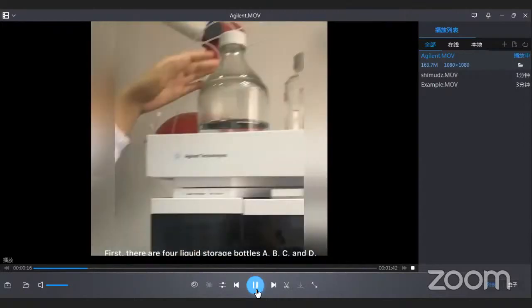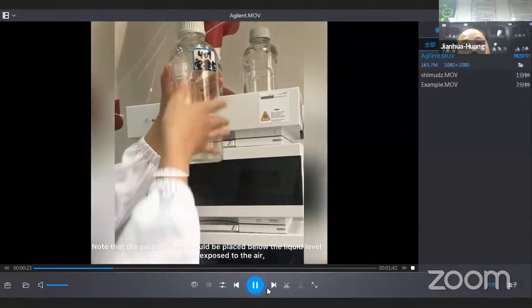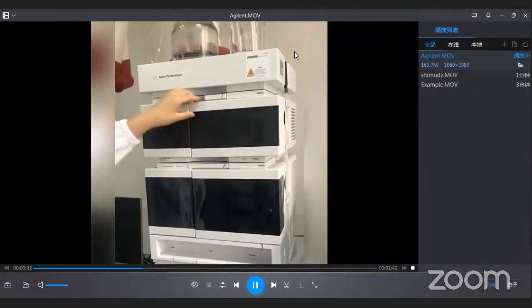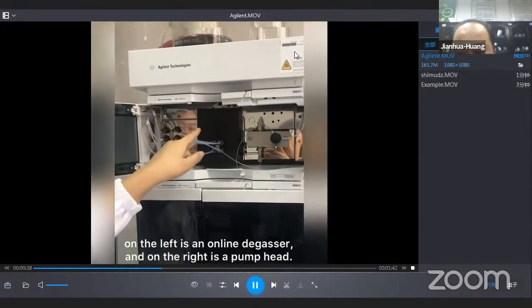C and D, which are used to store the mobile phase. Note that the suction filter should be placed below the liquid level and cannot be exposed to air. Now the voice is clear. Bubbles will be generated and the use of the instrument will be affected. Below the tray is a high-pressure infusion pump. On the left is an online degasser.